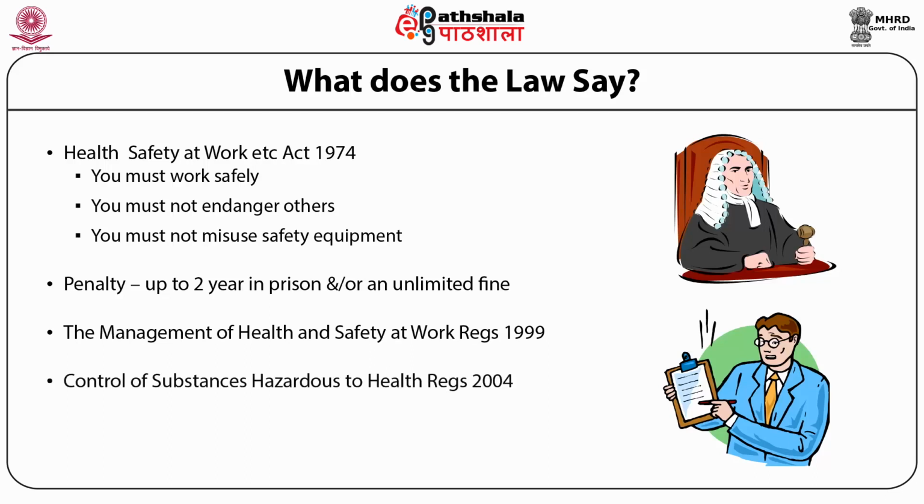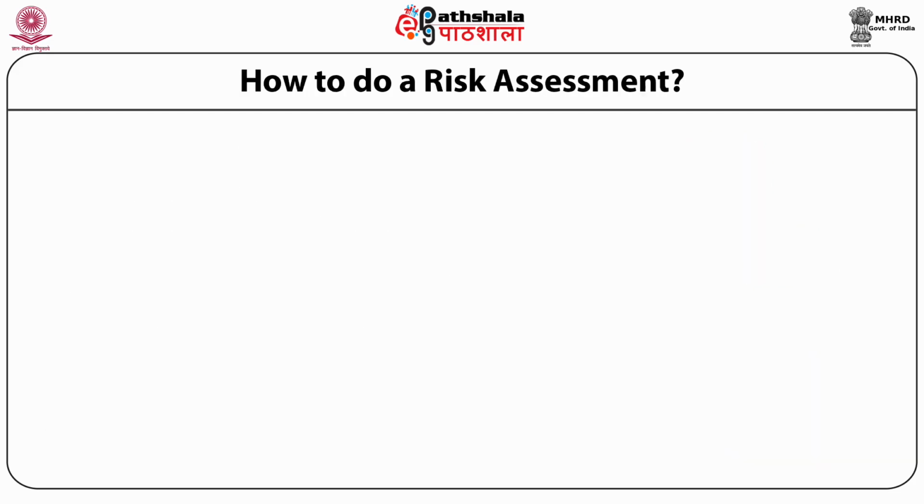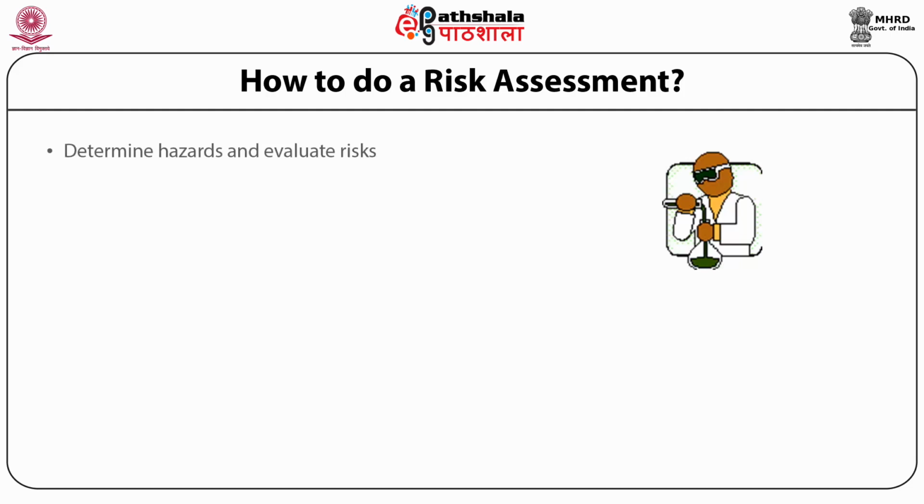The Control of Substances Hazardous to Health Regulations 2004. Hence, you must always perform a risk assessment. So how does a risk assessment happen, or how do we measure the risk? You have to determine the hazard and evaluate the risk.